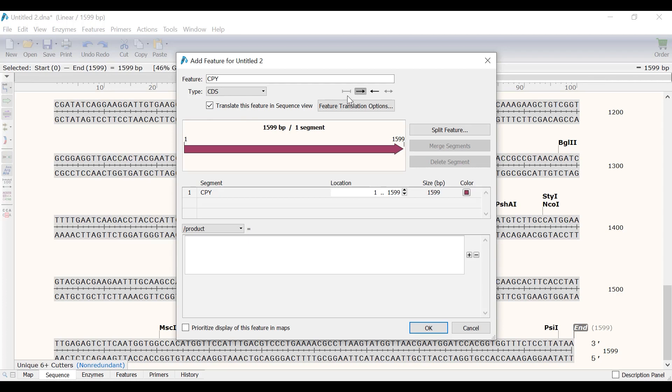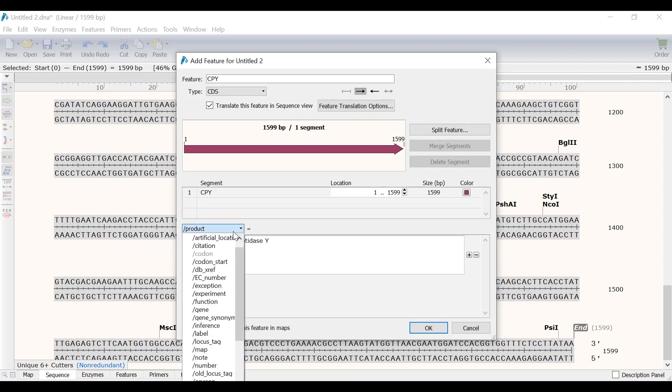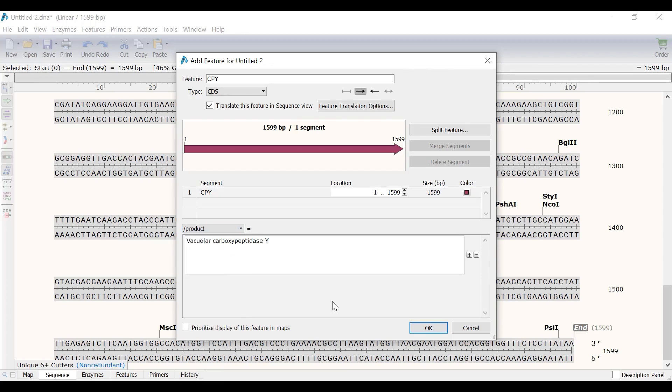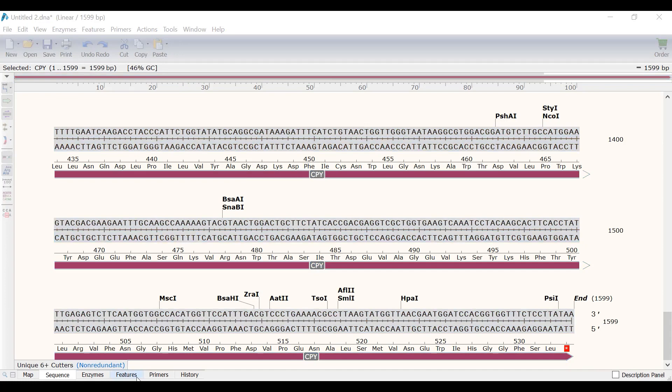It's possible to specify the orientation of the feature by using the arrow options, but I will leave this as default. At the bottom, I will enter the product name for my own reference. It is also possible to add additional information about the feature by using the different options in the drop down menu. Finally, I will click OK to create the feature. You will now see a purple arrow that spans the sequence. This indicates the feature annotation.